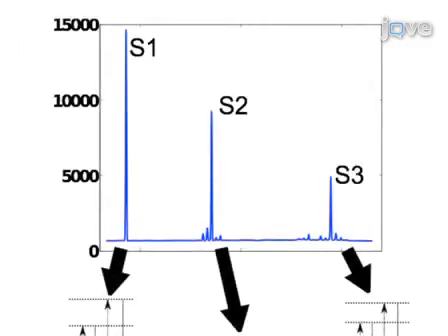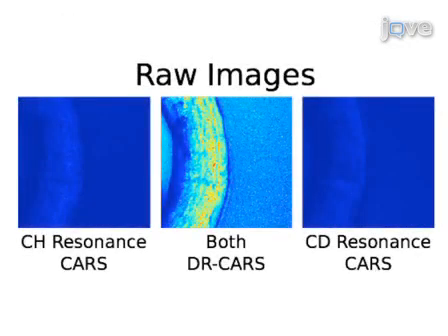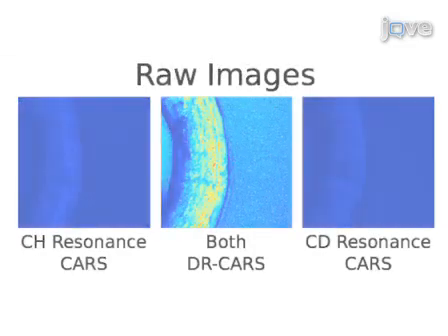The signal strength for each peak will need to be optimized by tuning in fine steps around these peak locations. Here we select each peak and take images of C. elegans worms in a solution of deuterated glucose. Extracting additional information based on these 3 individually obtained images requires some fairly simple image processing.